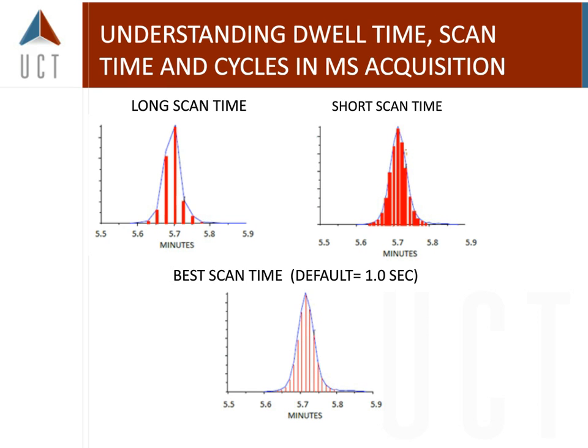on that particular peak. And all of us have seen peaks in the beginning of our profiles that are usually worse than they are at the end of the profile. I always say that in chromatography, it's that beginning. It's those compounds that you're trying to get initially that are the most difficult. After the first minute or so, your gradient sort of smooths out, and then basically you'll get better peaks as the run goes on.